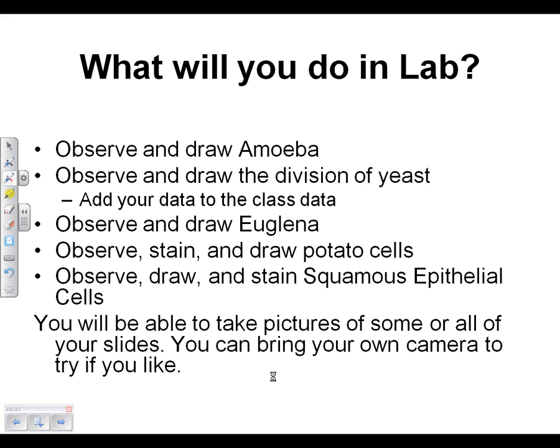And in general, what you'll find is the amoeba are going to be on the very bottom of the jar. So if you want one, reach in with the plastic transfer pipette and suck up a little bit of liquid directly from the bottom of the jar. The technical term for it is crap that's on the bottom. You'll see there's some stuff, which is mostly food for the bacteria that the amoeba then eat, on the bottom.